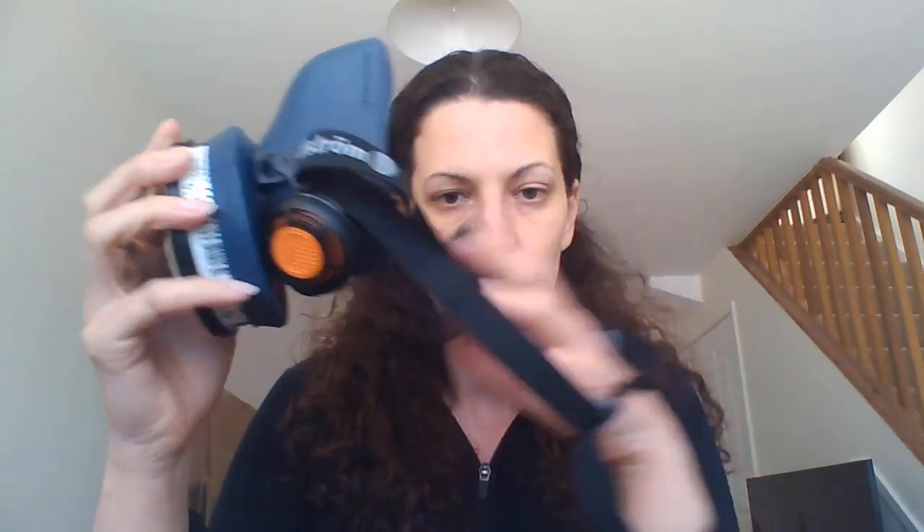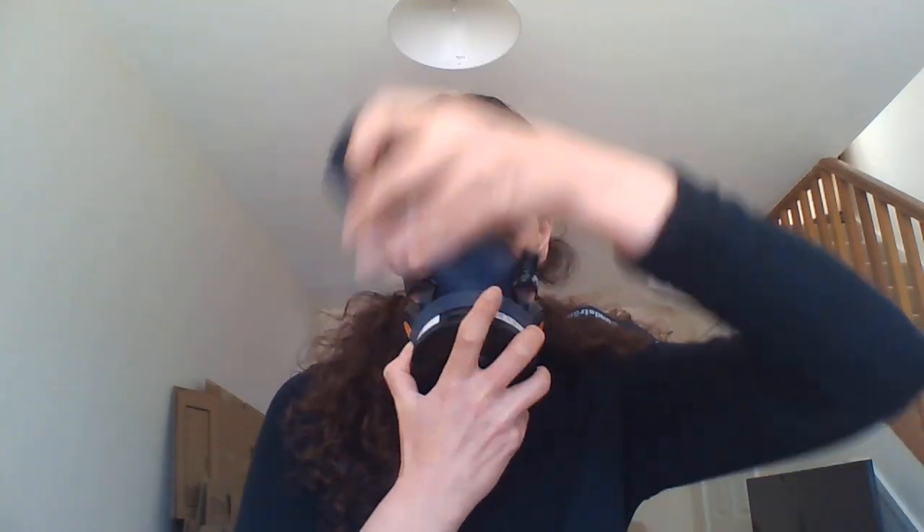You also get a cap with these masks. You put it on like so — just click it on the front of the filter; there's a nice reassuring click. Now the main reason that cap is there is to help you do a face fit test. To ensure your mask is working, put it on — strap around the back of your head — and you'll notice there's a hole here in the mask. That's where you do your face fit test.